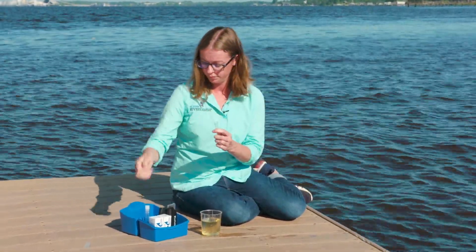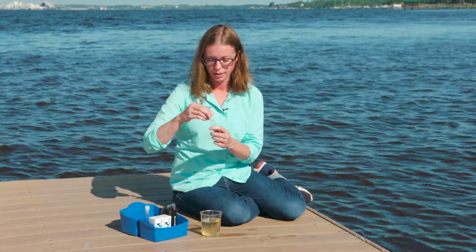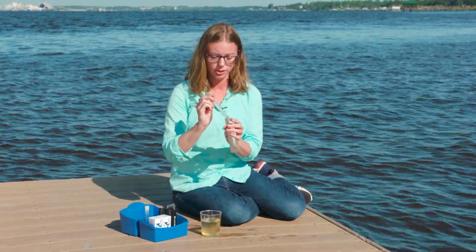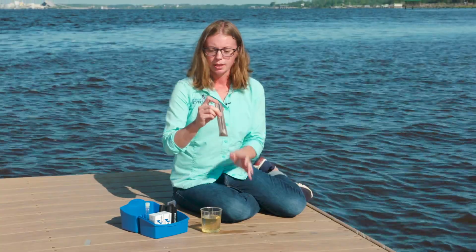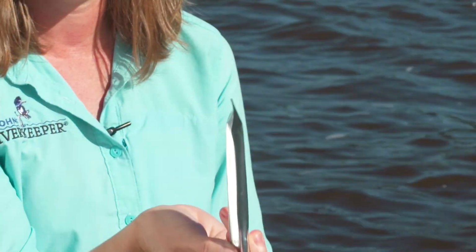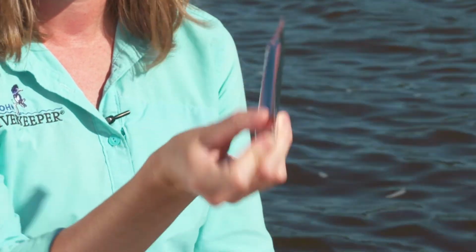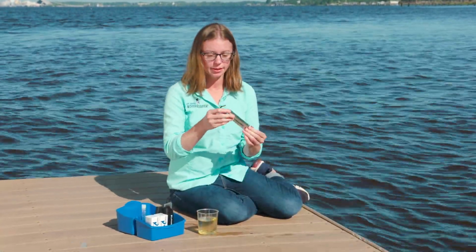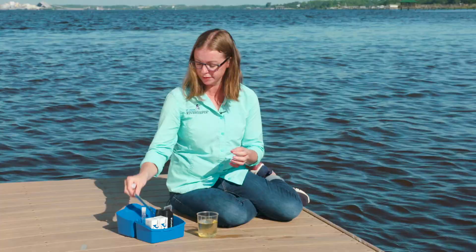I'm going to add tablet number 2, cap it, and put it into a little protective sleeve and invert for about 2 minutes for the tablet to dissolve. We put the tube in a protective sleeve because the sun can cause the chemical reaction to change. So our second tablet has now dissolved. I'm going to take the tube out of our protective sleeve.